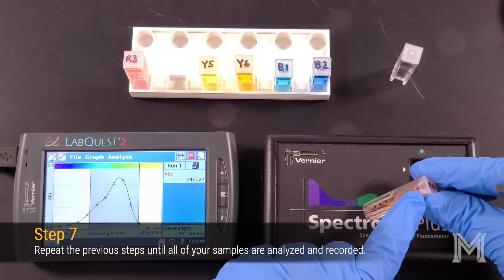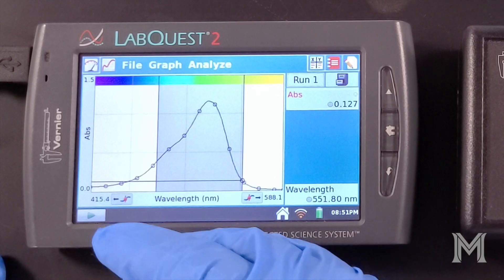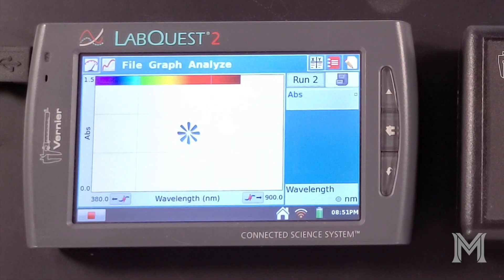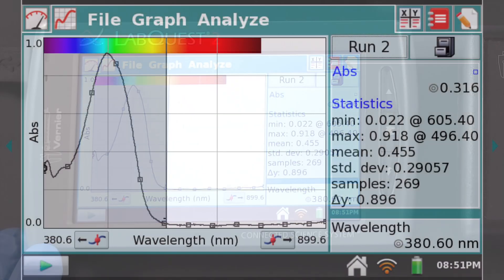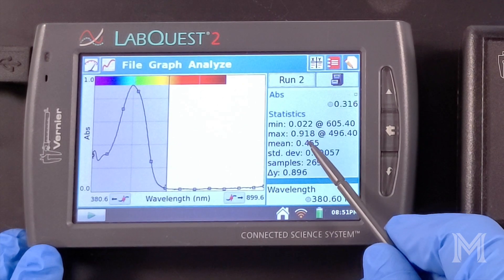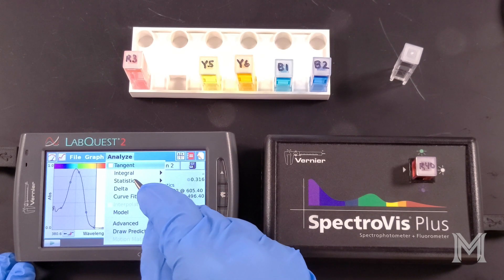Remove your dye standard from the spectrophotometer and select another dye standard to analyze. Insert your standard into the spectrophotometer, making sure the arrow on the cuvette aligns with the arrow on the spectrophotometer. Use the Play button to record your next spectrum. Select Store to save your previous spectrum. Stop the data collection when you have obtained a stable spectrum. This dye also absorbs in the blue-green region of the spectrum, with a maximum absorbance of 0.918 at a wavelength of 496.4 nanometers. Select Statistics from the Analyze menu to clear the Statistics panel.